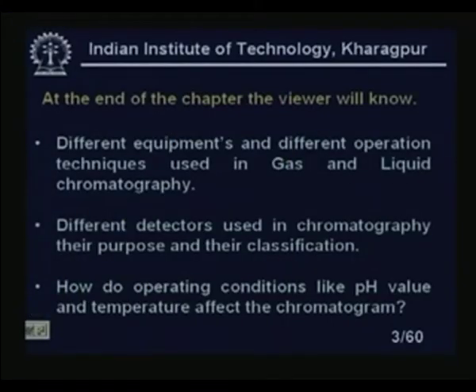How do operating conditions like pH value and temperature affect the chromatogram? We will find these things also. The pH value is not very important in the case of gas chromatography, but it is very important in the case of liquid chromatography.